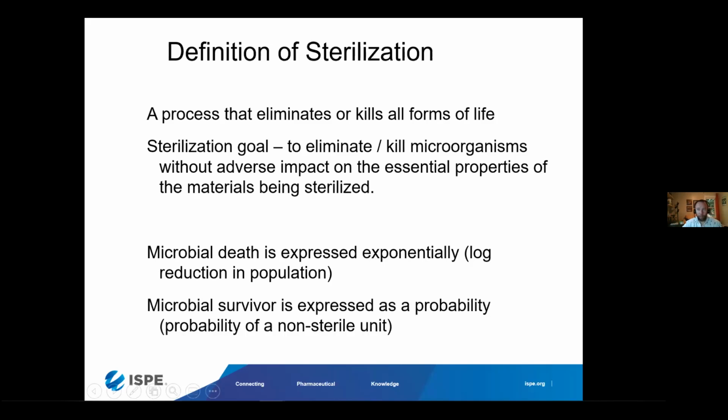And likewise, microbial survivor is expressed as a probability. So a probability of a non-sterile unit. This is a common term in our industry. Also a sterility assurance level. These are probabilities to demonstrate to a certain level that we do not have any surviving organisms.